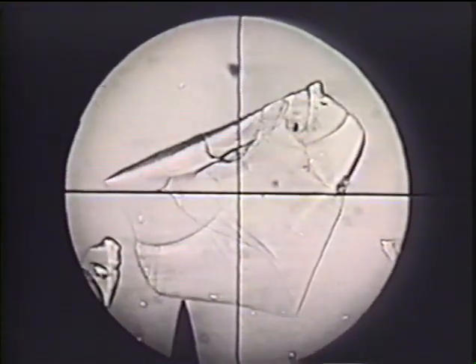Let us look again at a grain of glass in oil. With the condenser iris almost closed its outline is stronger and a bright line can be seen round the edge of the grains. This is called the Becky line and is very useful for determining the refractive index.